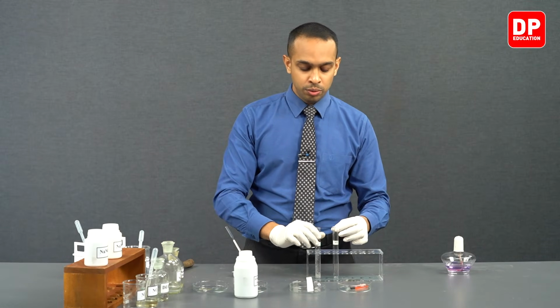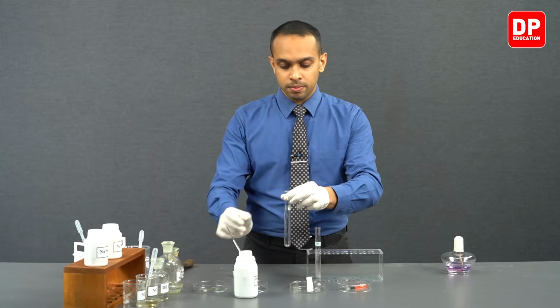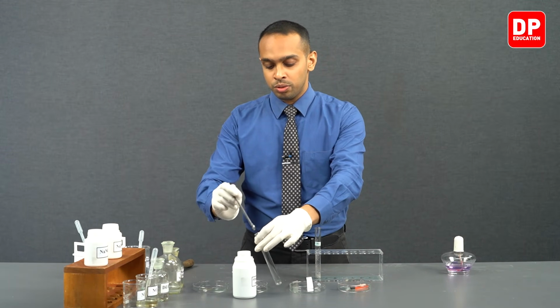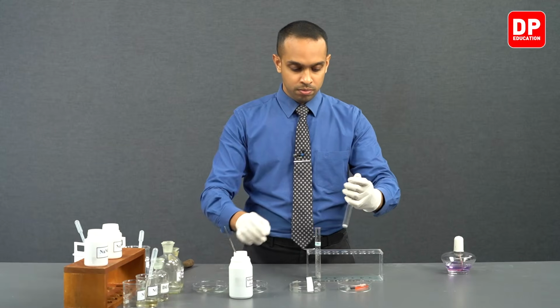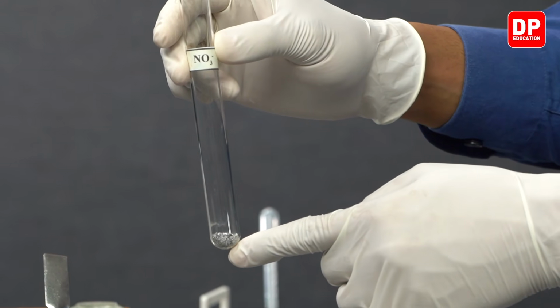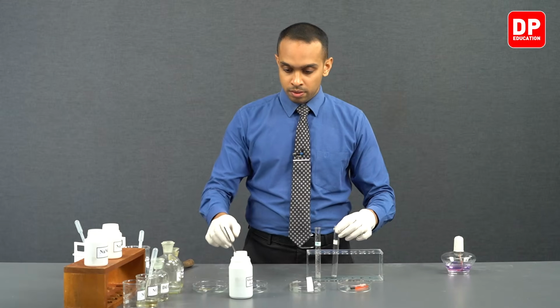We'll do the same to the test tube labeled nitrate ions as well. Later on, we'll be adding nitrate ion solution to this test tube. Now we have taken aluminium pieces and a bit of aluminium powder to this test tube as well.